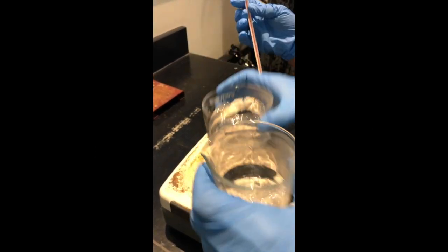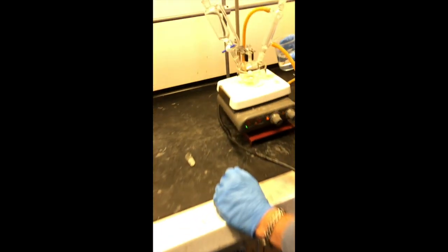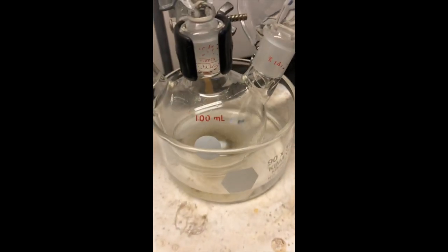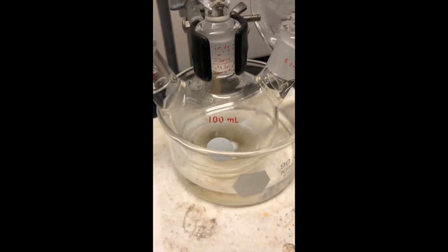Warm water that we've been warming outside the hood so we don't risk fire. We're going to add the warm water to the crystallizing dish to make sure the reaction keeps going. You can see the reaction continues to get more and more cloudy.